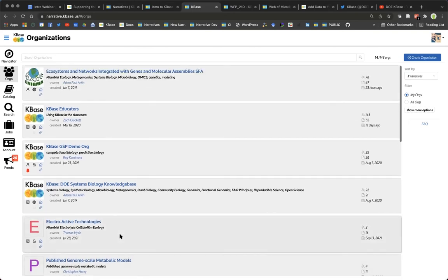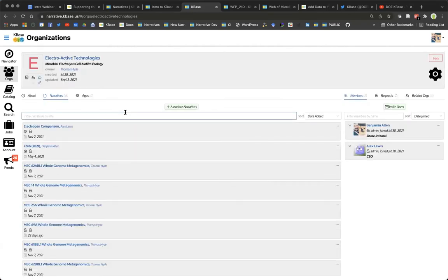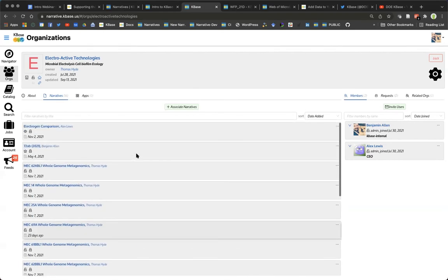Just for instance, this is a project that I've been working on with some people, and here we've shared the list of all of the narratives that we've been working on together. Anyone that's in this organization can access the associated narratives.